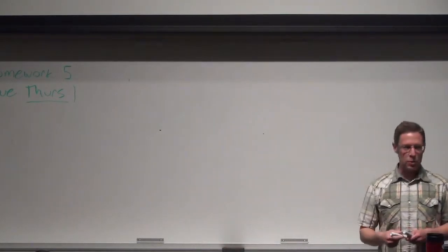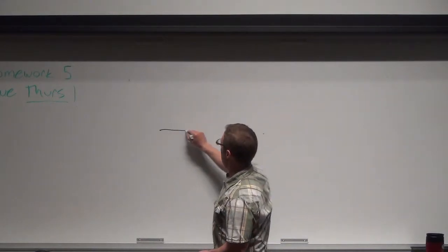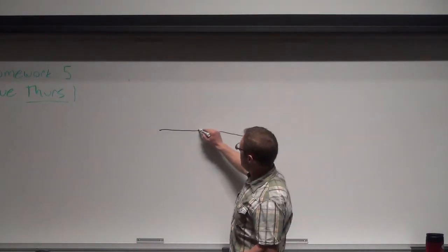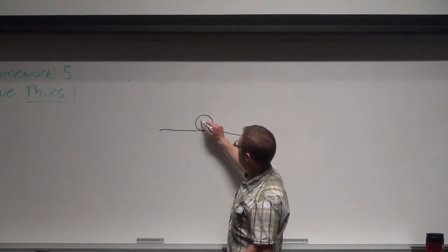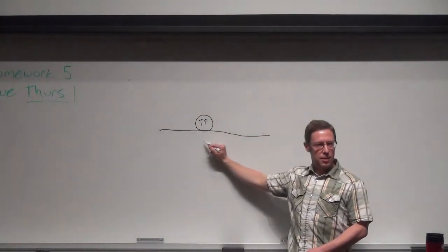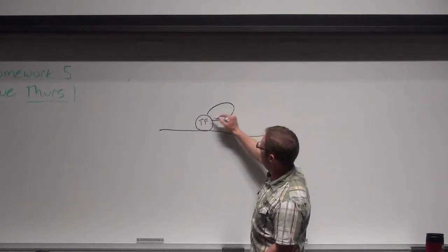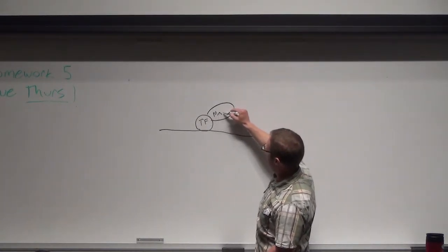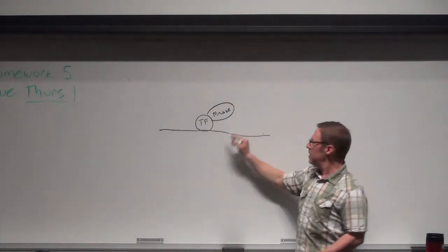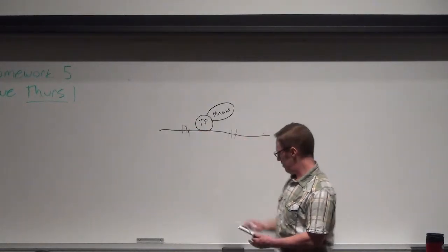ChEC-seq is what this new method is called. It uses a slightly different approach, and the authors argue that it has some advantages. Again we have our DNA and our transcription factor, but instead of cross-linking proteins to the DNA, they express a transcription factor that's fused to a micrococcal nuclease, we'll call it MNase. In the presence of calcium, this will cleave the DNA around the binding site.